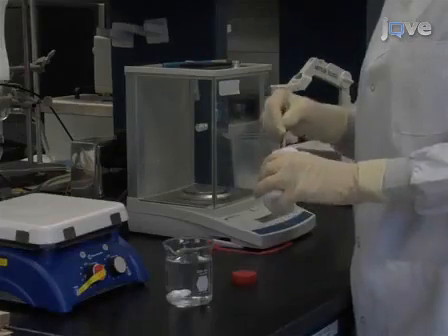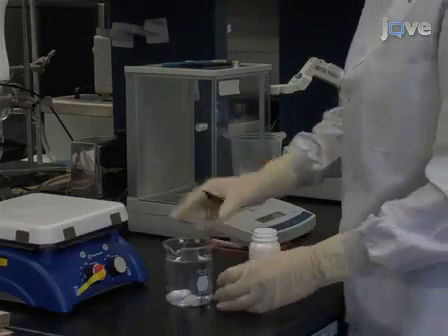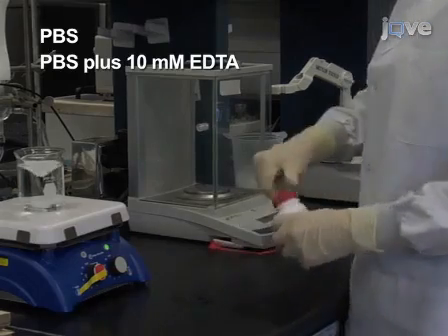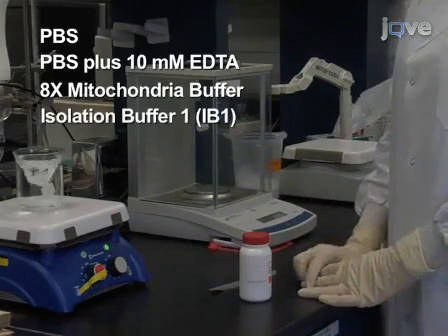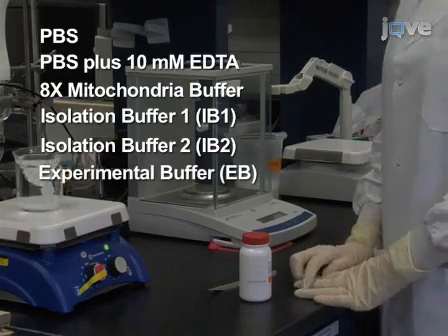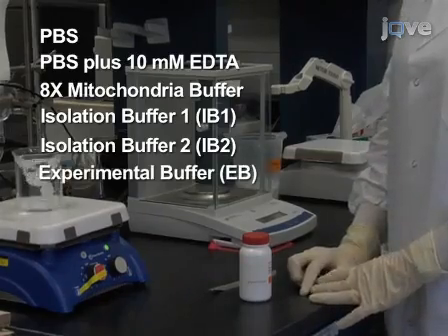Before beginning the procedure to isolate rats' skeletal muscle, prepare the following solutions: PBS, PBS plus 10 millimolar EDTA, 8x mitochondria buffer, Isolation Buffer 1 or IB1, Isolation Buffer 2 or IB2, and Experimental Buffer or EB. See the accompanying written protocol for instructions.